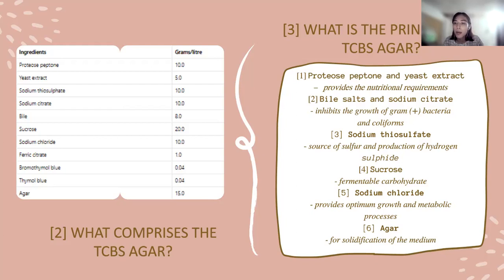So bacteria utilize sucrose as their fuel in producing ATP, or their energy that can be used within their system to undergo certain life processes, like cell signaling, the transport of nutrients, and transport of molecules in and out of the cell. Those are such things that use ATP.